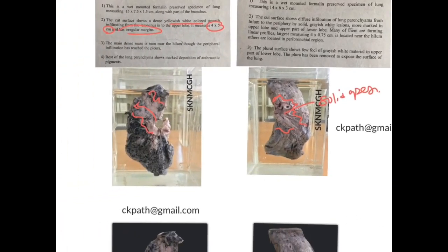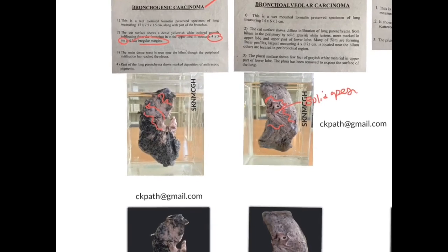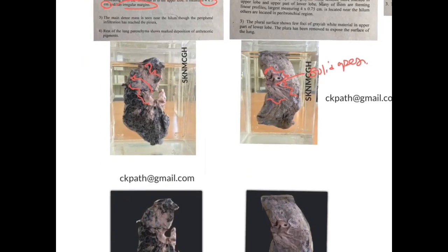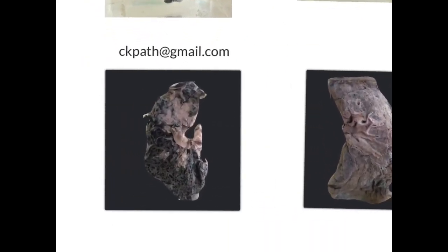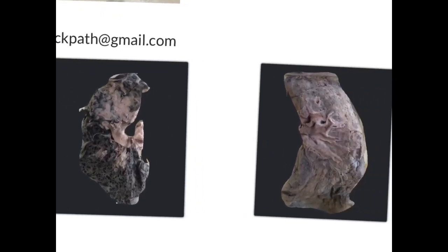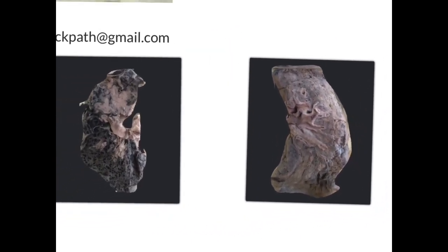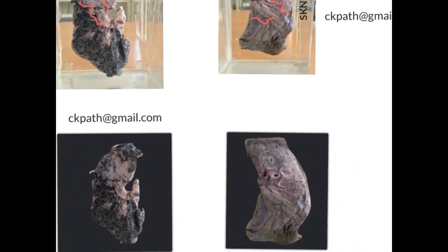Here, when we are describing a lung tumor specimen, one thing to remember: don't comment on whether the pleura is thickened or not; instead, comment on whether the pleura is present or not. For example, in this specimen you have a pleura, which I have cut while editing this figure, but in this case you don't have a pleura, which is already stripped off. So these are the two main differences which you should learn and talk about when you are describing the specimens.